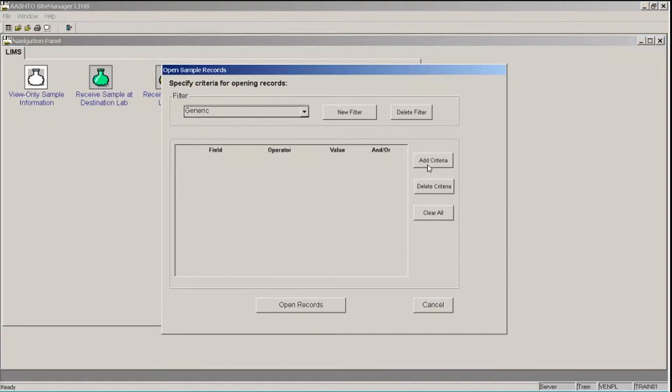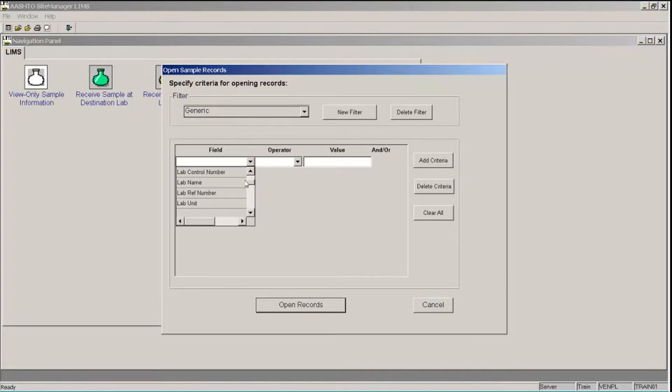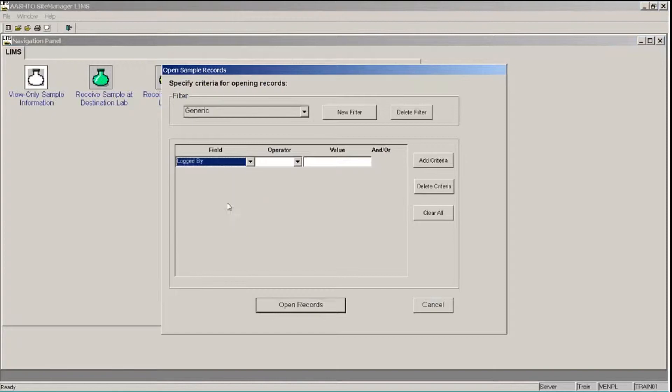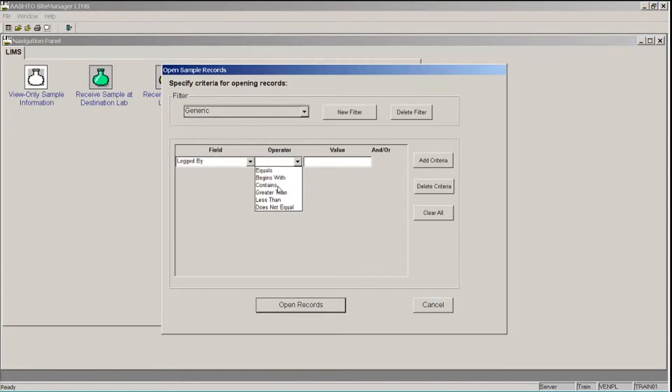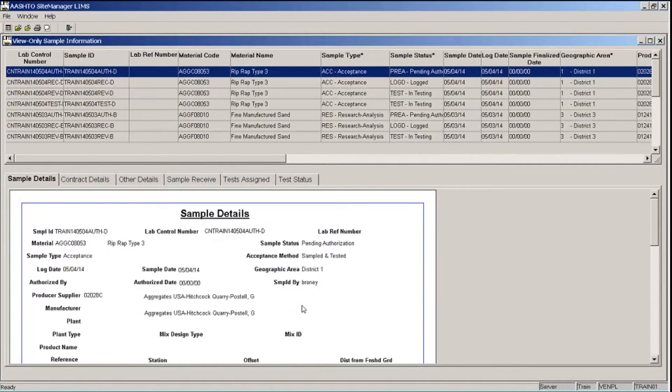I'm going to click the Add Criteria button. In the field drop-down list, I'm going to select Logged By. The operator, I'll choose Contains. And in my value, I'm going to type Train in uppercase letters. And I'll click the Open Records button at the bottom.